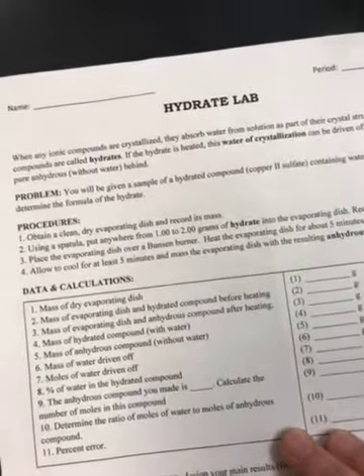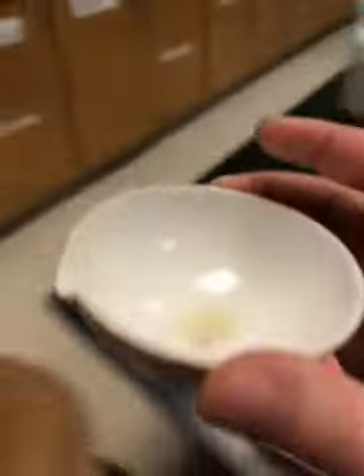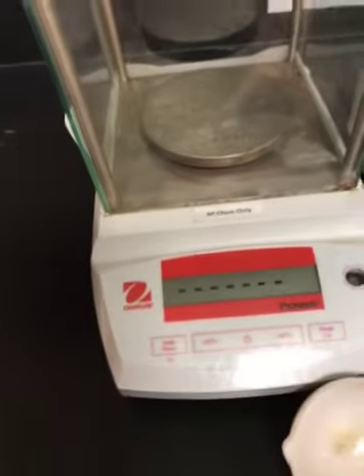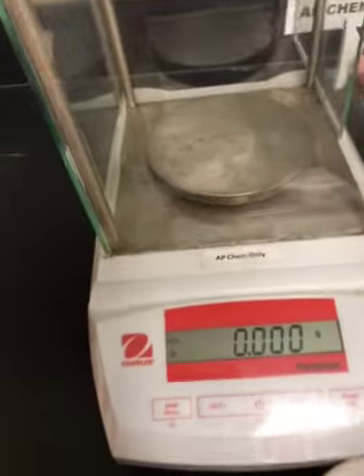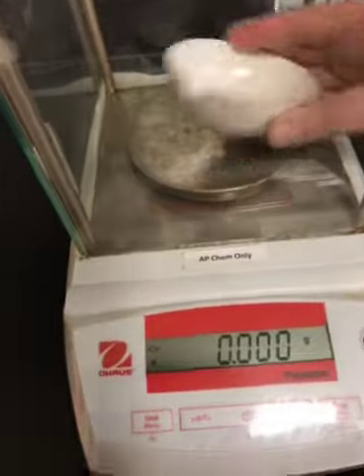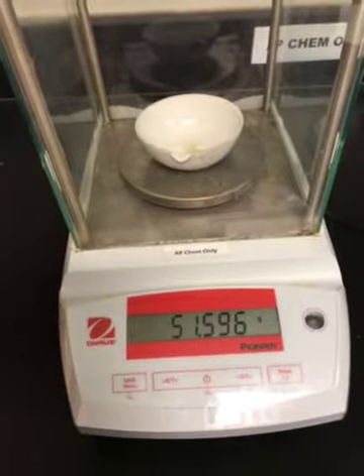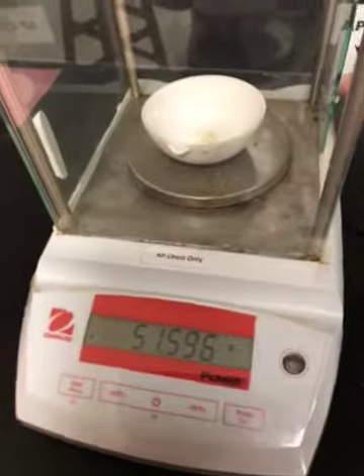It says obtain a dry, clean evaporating dish and mass it. So this is what an evaporating dish looks like. We're going to go ahead and mass that. So we get our balance. Close here. Make sure that we hit 0. And I'm going to put it in here. And we're going to record the mass. Okay? Let's read step 2.